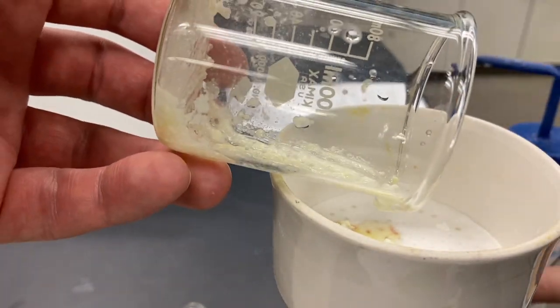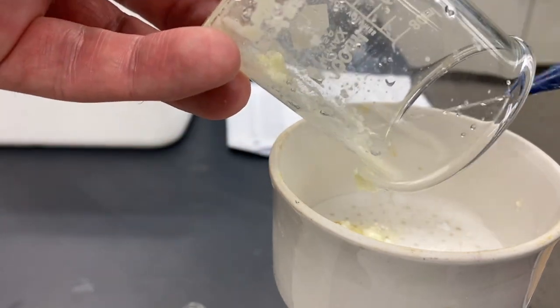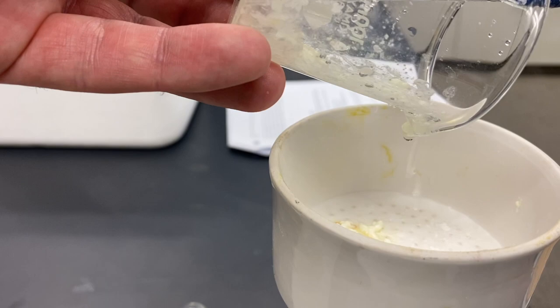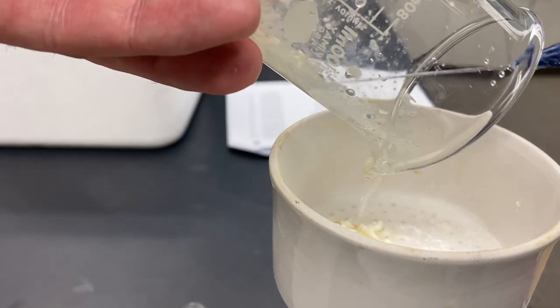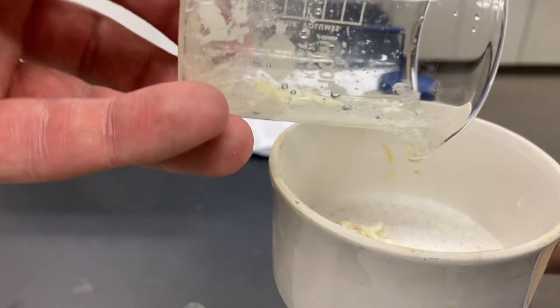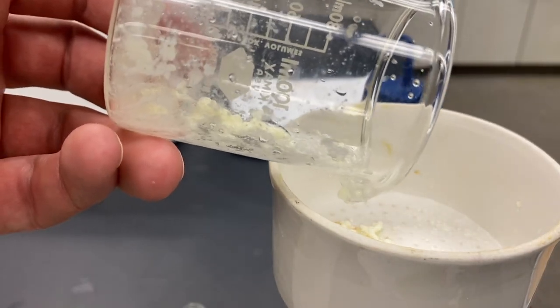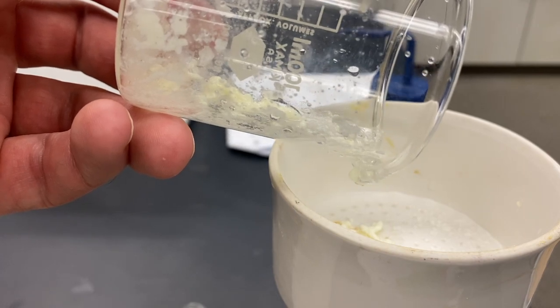Sometimes it's helpful to just coax this out with some water. So I'm going to go ahead and stop the video. And we'll come back when I actually get all of this out.